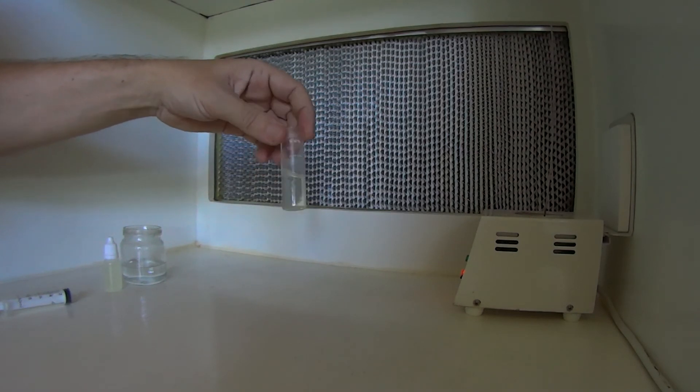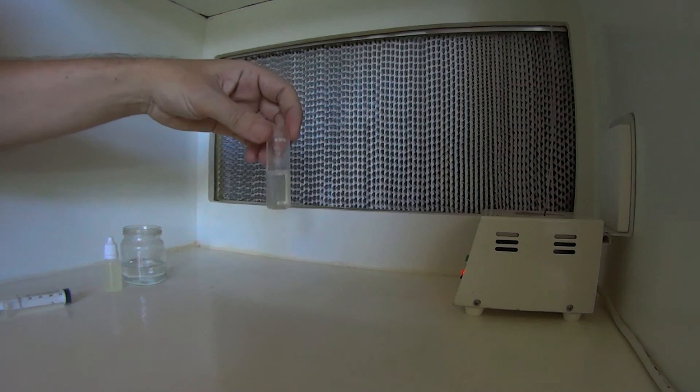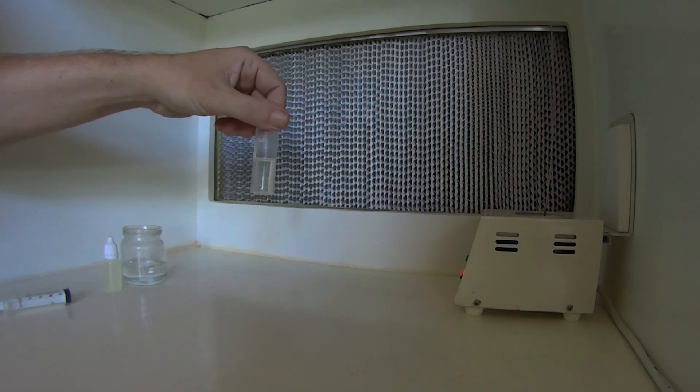Now what we simply do with this is add it to our required volume of water. So measure out whatever water you need to mix it with to get your correct parts per million, and add it. And it's pretty simple.